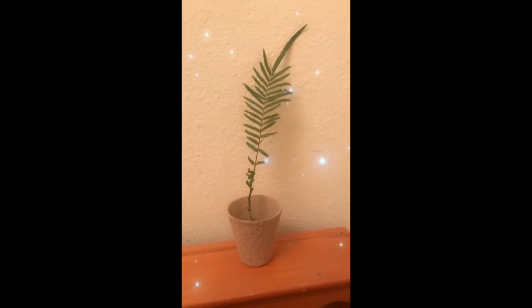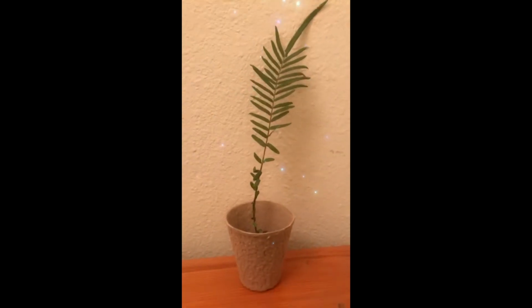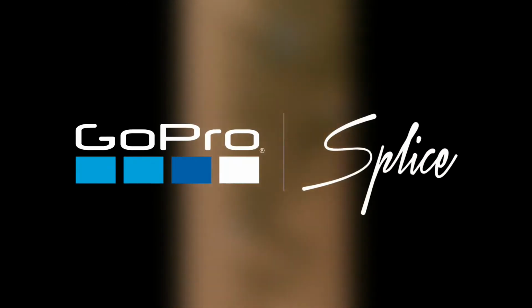After the allotted time has elapsed, take your inoculated and growing ferns and sow them into their own pot. An inoculation into another inoculation. Place outside and wait. And finally, reveal your fully grown fern. This is how you win a fern growing competition.